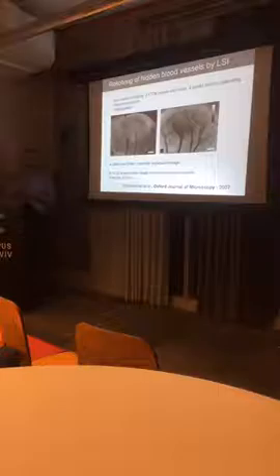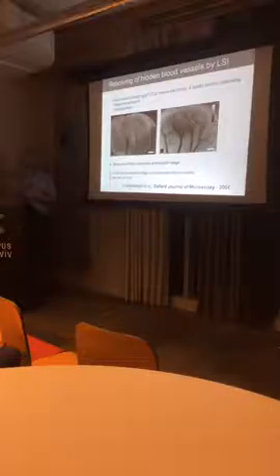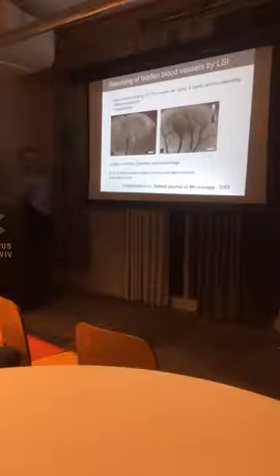Sorry. I think maybe what Uri was referring to is, what is the difference when you illuminate with a laser, you get a speckle pattern. If you were to illuminate with a monochromatic LED, you wouldn't get a speckle pattern. So what does the speckle pattern give you as opposed to plain illumination with the same wavelength? If I use the same wavelength as plain illumination, I would not see even this.